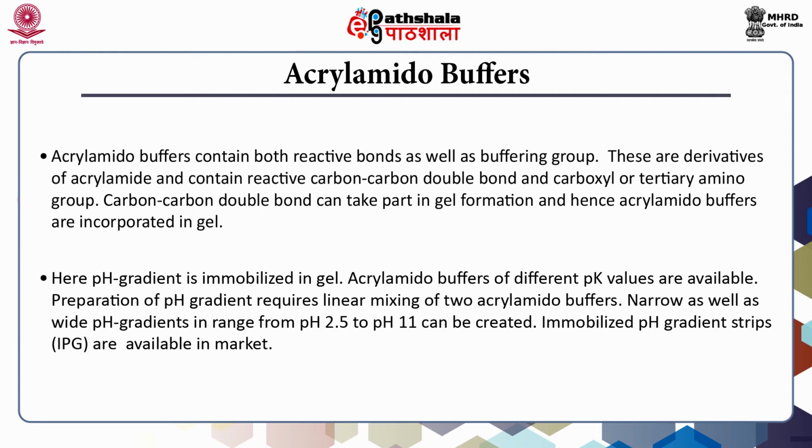Larger size protein molecules cannot enter into the gel matrix directly, and an applied voltage in the range of 30 to 100 volts can pull the protein molecules into the matrix. Smaller molecules enter into the matrix by absorption.